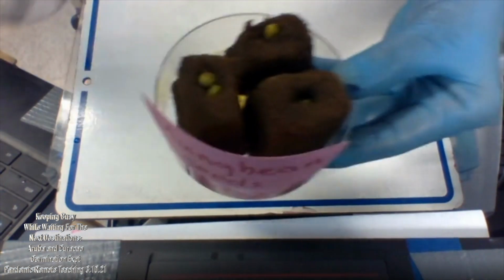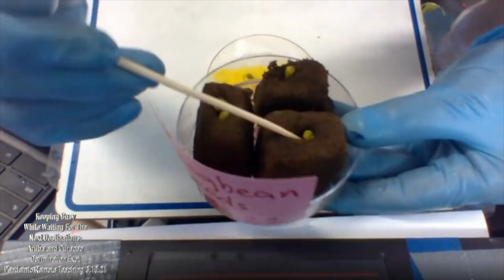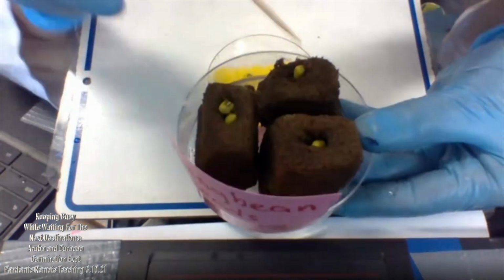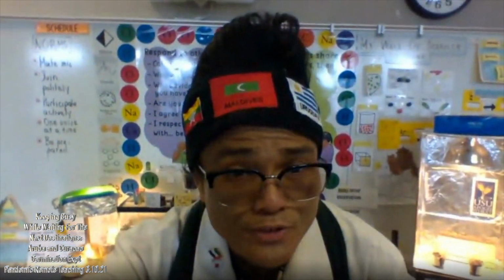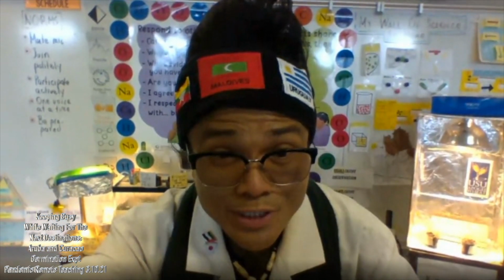Brianna said grow fast. And this is, let me see. Oh wow, look at this. Wow. It's bigger because the moisture or the water keeps them becoming active, because seeds are not active. They are dormant, not active. When water is provided, then they become active. All right, they start the process of growth, or in other words, germination.